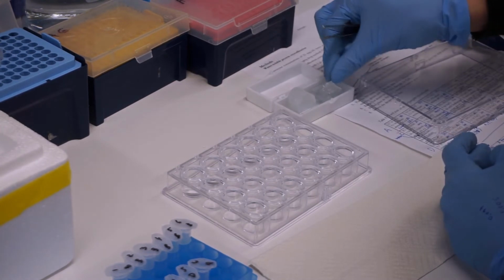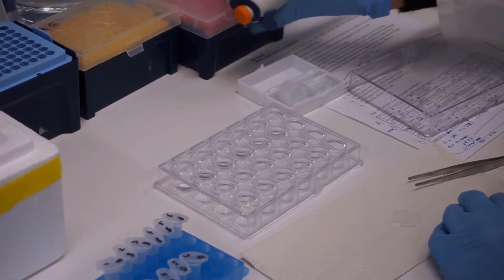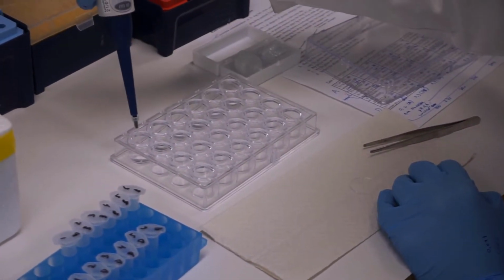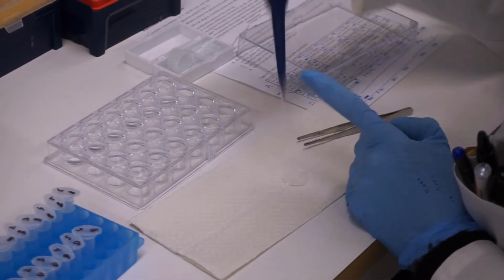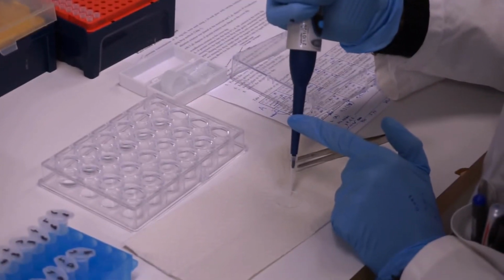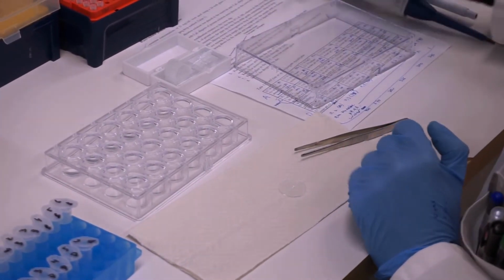Pipette 2 microliters of crystallization solution onto the cover slip. Then, pipette 2 microliters of protein solution into the drops of 2 microliters mother liquor solution on the cover slip.